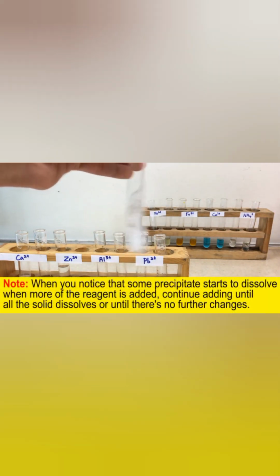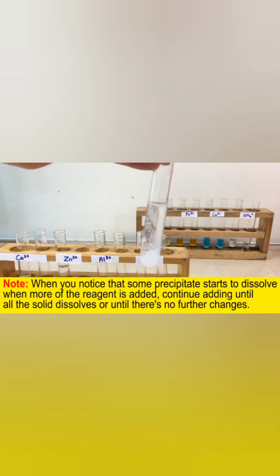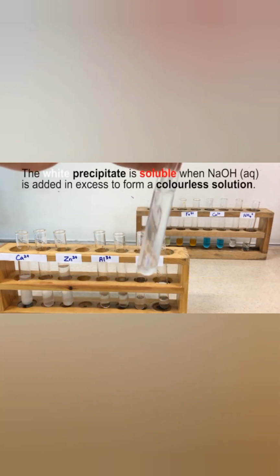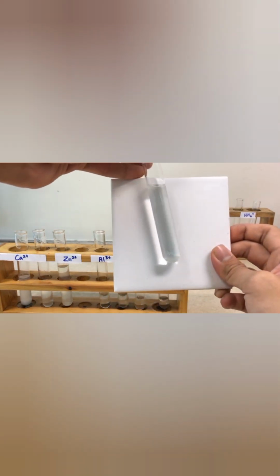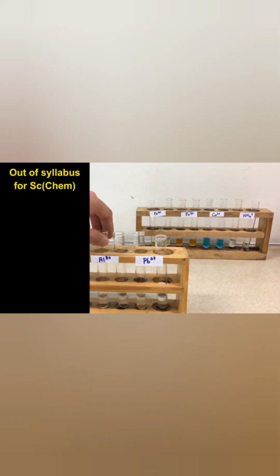Now when aqueous ammonia is added in excess and you shake it, the precipitate starts to dissolve when more of the reagent is added. If you continue adding until all the solid disappears, you find out that the white precipitate is soluble in excess aqueous ammonia, and a colorless solution is observed.